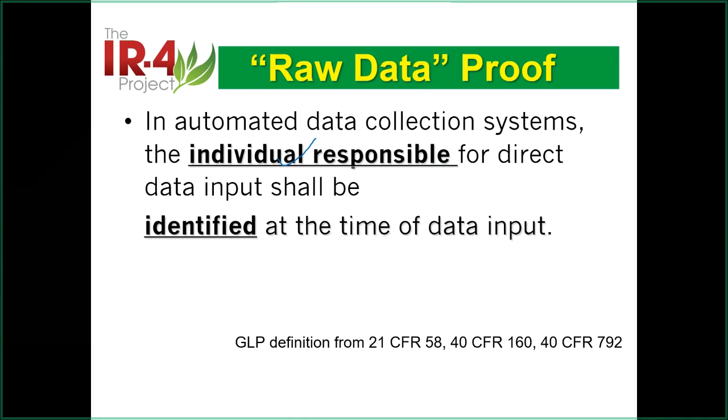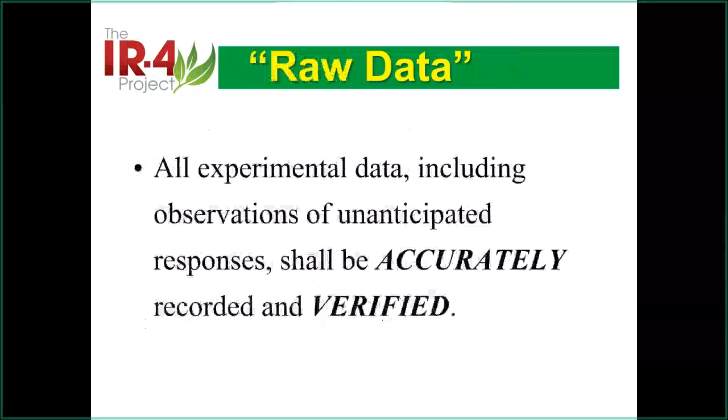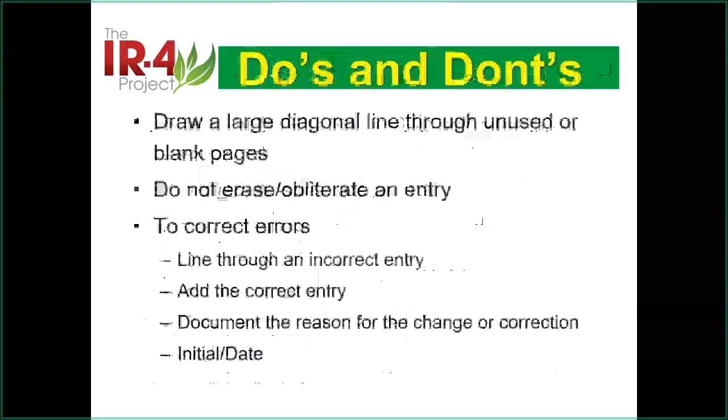That should be the same for paper. If there is something like that, that person needs to sign and date. That should be the same for all data, and the purpose is to reconstruct your work. So we can go through this quickly.